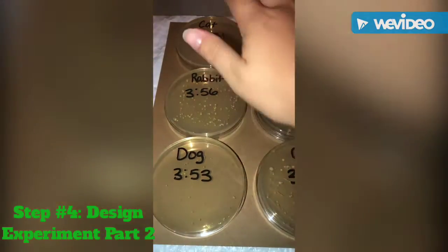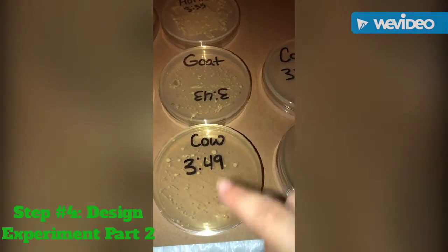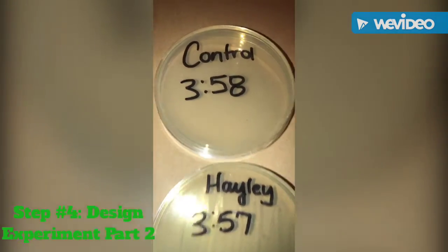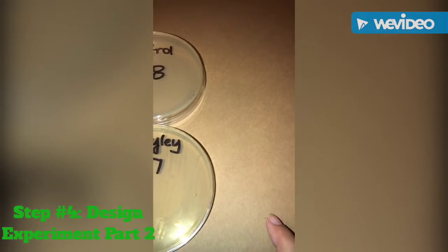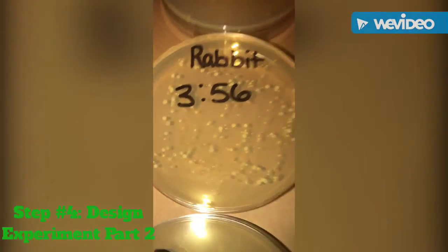So I have my variety of different animals. I have my cat, my rabbit, my dog, my horse, my goat, my cow, myself, and my control Petri dish. So I set these up on a dark surface, which is construction paper, so you can see where I have put the bacteria. This is day 2, but this is my setup of my experiment.